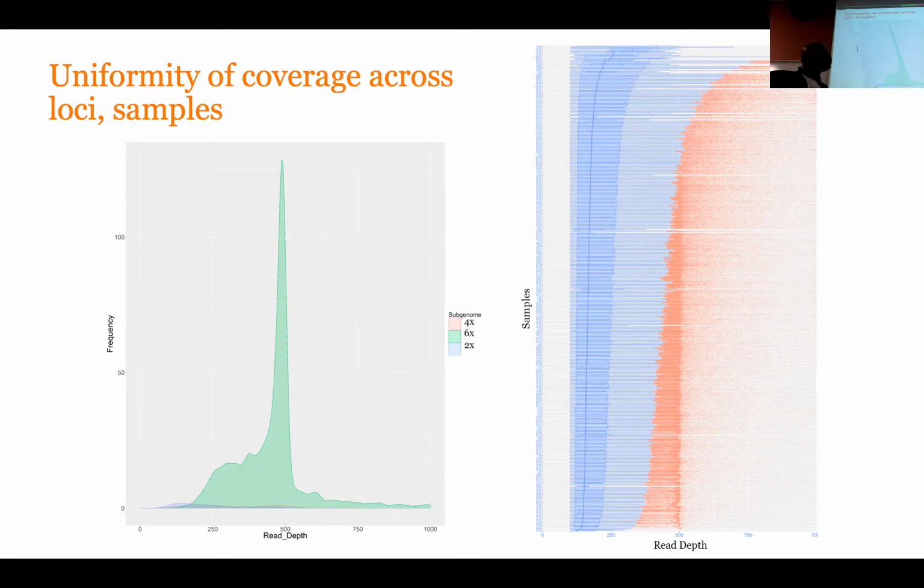But what we're going to be doing following our SNP calling for this lab session is we're actually going to use VCFtools to pull out the genotype information, the read depth, and then we're going to pull out information on the reference allele and the alternate allele.